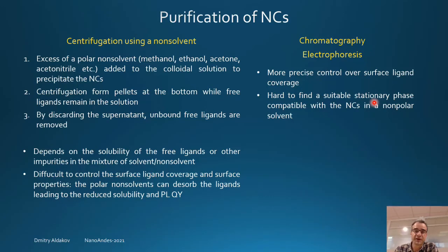One word about purification of nanocrystals, because to me it's a part of the synthesis. If you synthesize good nanocrystals but you cannot purify them, it's useless. So the classical purification is by centrifugation with a non-solvent. Usually you prepare your nanocrystals in non-polar solvents like toluene, hexane, and so on. You add to this mixture a polar non-solvent like methanol, ethanol, and so on.